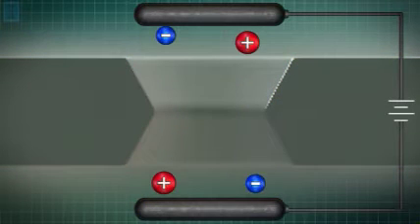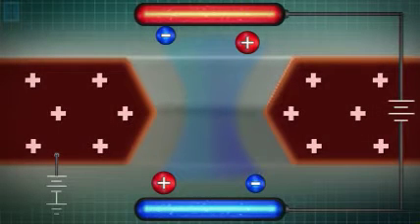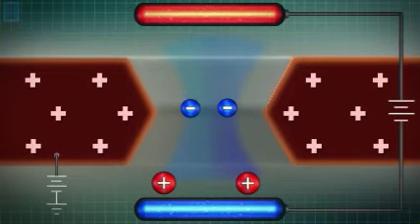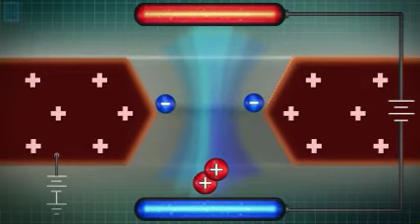For instance, a single membrane and pore immersed in ionic fluid and bracketed by charge plates. Adding a bias to the membrane creates a charged membrane and field within the pore. The electrical conditions of the membrane can be changed to trap entities within the pore. The stronger the bias, the stronger the field gradient in the membrane pore.